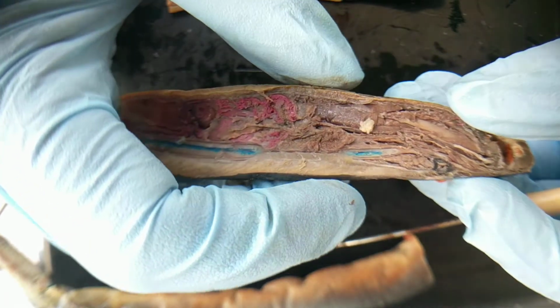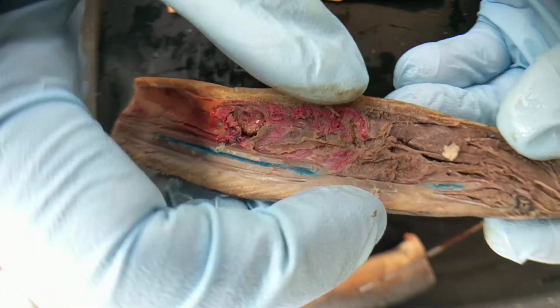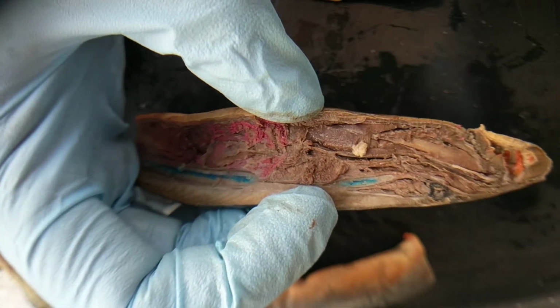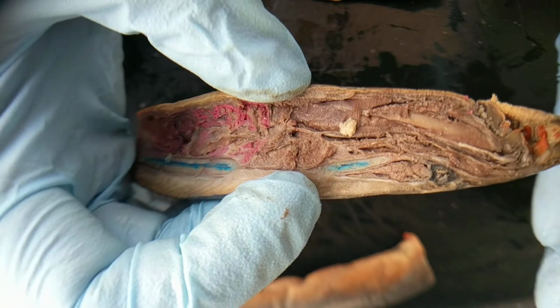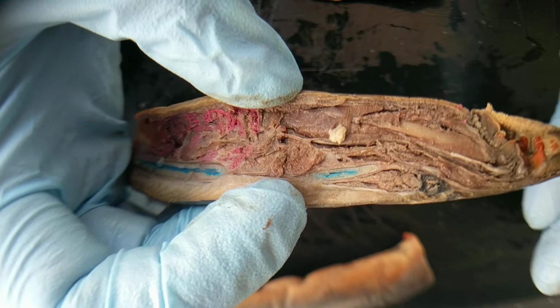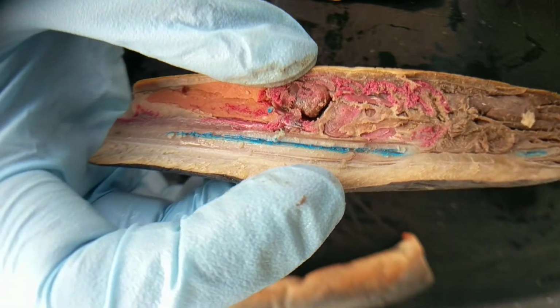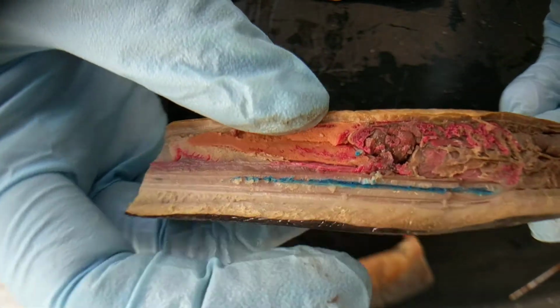All right, let's look farther in. Well, first of all, we're going to look for the gill slits. So just looking at some of the chordate traits, I'm just showing you some cool things about the lamprey now. The reason we're looking at the lamprey is because it's a representative, a living taxon now, obviously, but it has retained many of these very basal chordate traits, so we're able to see them very clearly in an animal that looks kind of like what we think the ancestor of all chordates looks like. So what are the chordate synapomorphies, right?